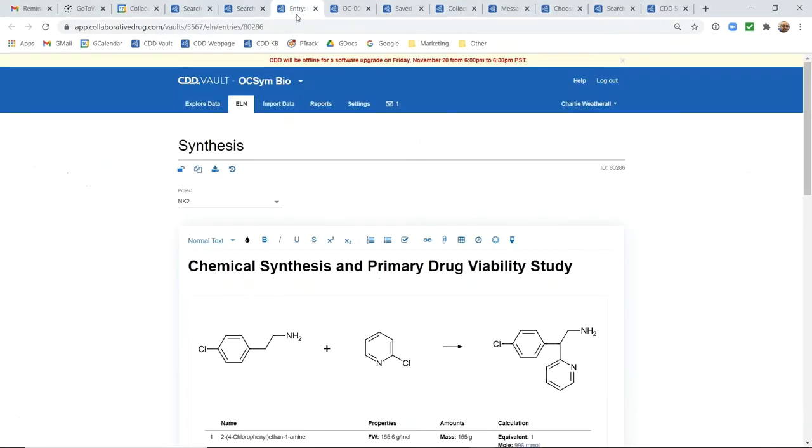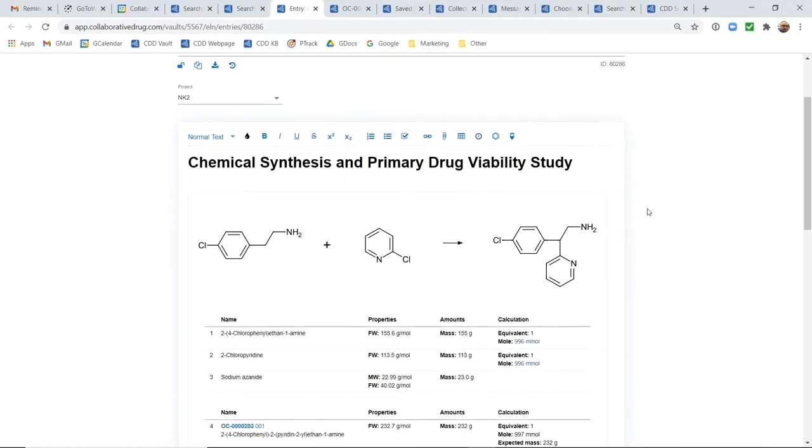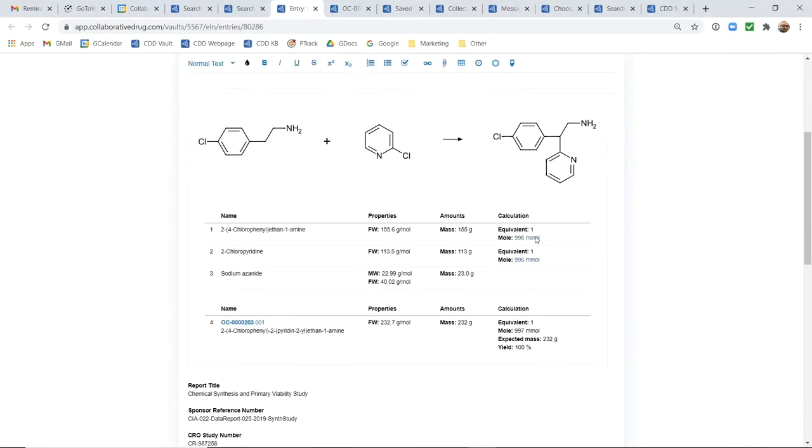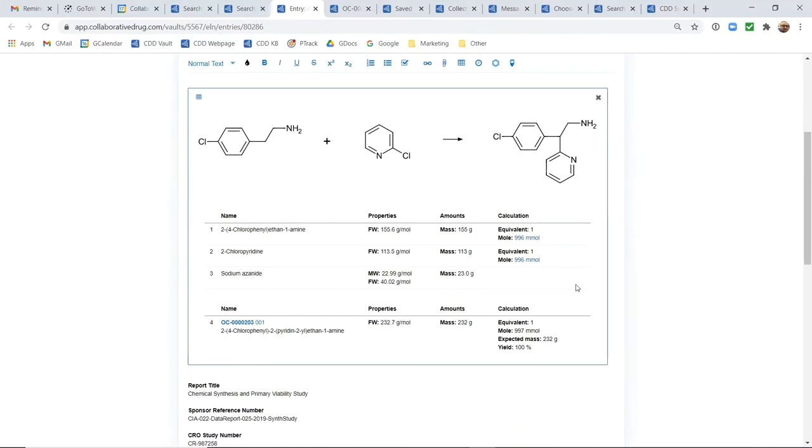If I go over to that ELN entry you'll see that we have an example of a synthesis here where we've drawn a chemical reaction. It gives us a full stoichiometry table here where I can interact with this stoichiometry table in edit mode and add reagents or I can simply draw the reagents above or below the arrow in my reaction.